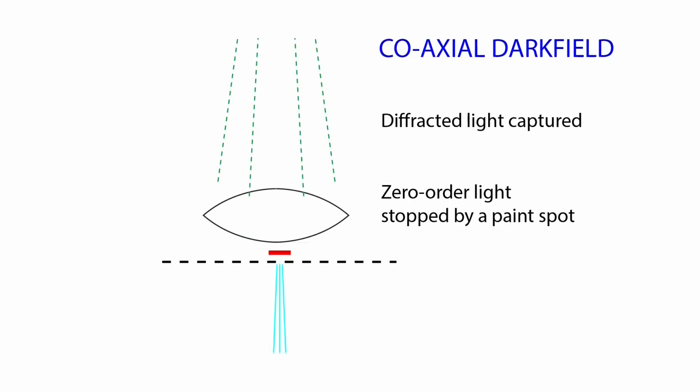He had some success using the coaxial dark-field method with the biological specimens, probably because he could capture the low spatial frequencies, which tend to be much brighter than the higher order light. If he did not remove the zero-order light, the dark-field image components would be overwhelmed by white background and contrast would be completely lost.